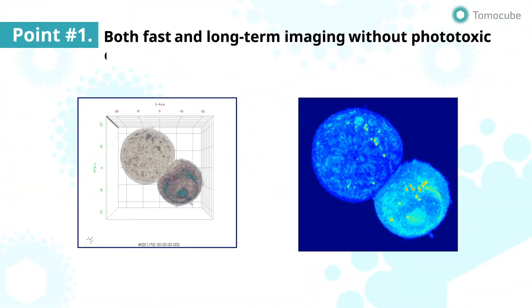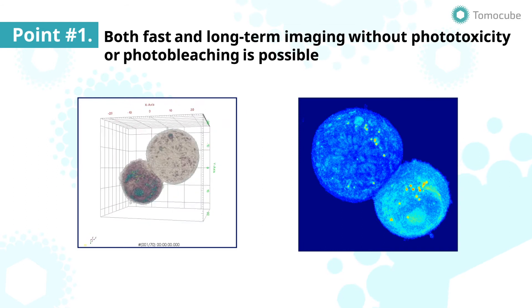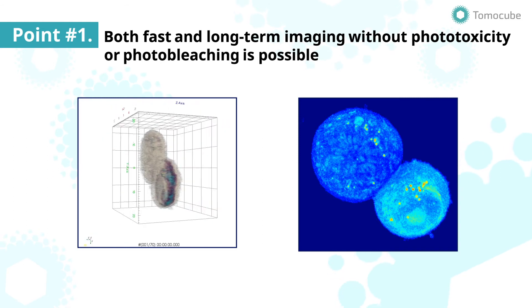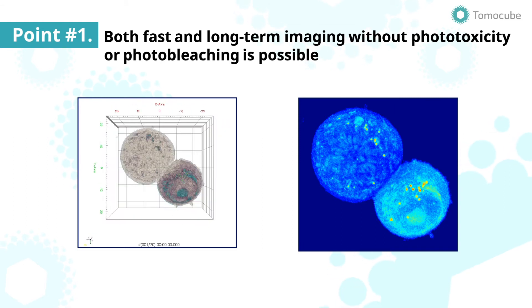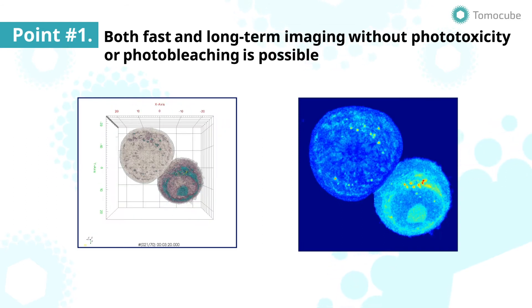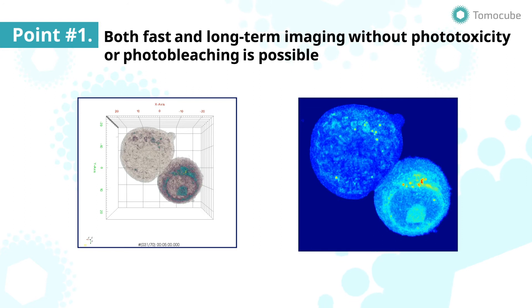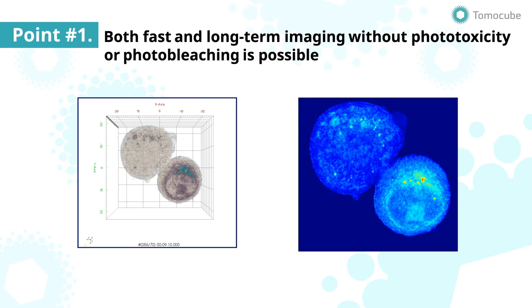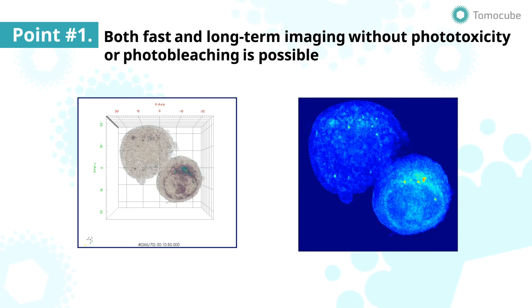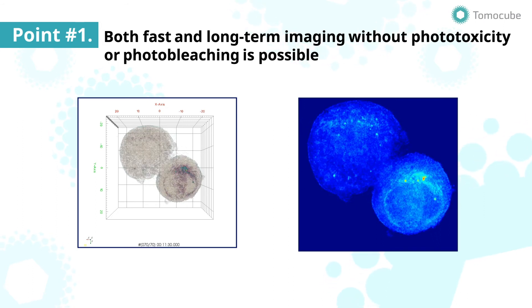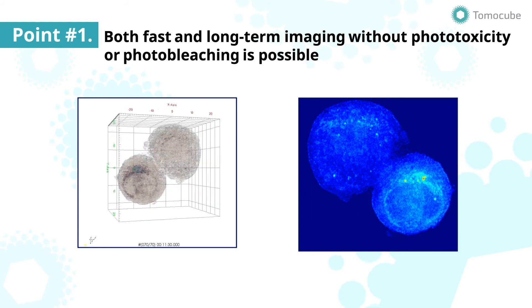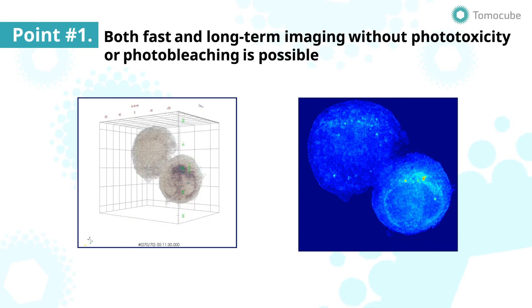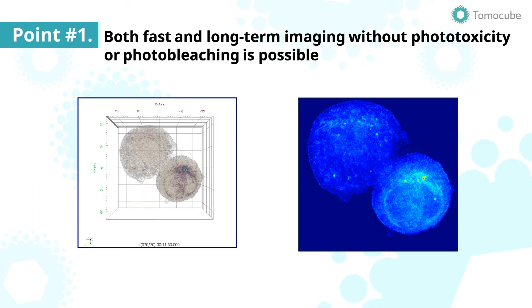Immunological synapse formation between cancer cell and natural killer cell has been observed using HT Timelapse. Using low-energy laser with fast acquisition speed, 3D holotomograms can be captured every 0.4 seconds. Therefore, it is possible to visualize the dynamically changing synapse in 3D in the cell-to-cell interaction.